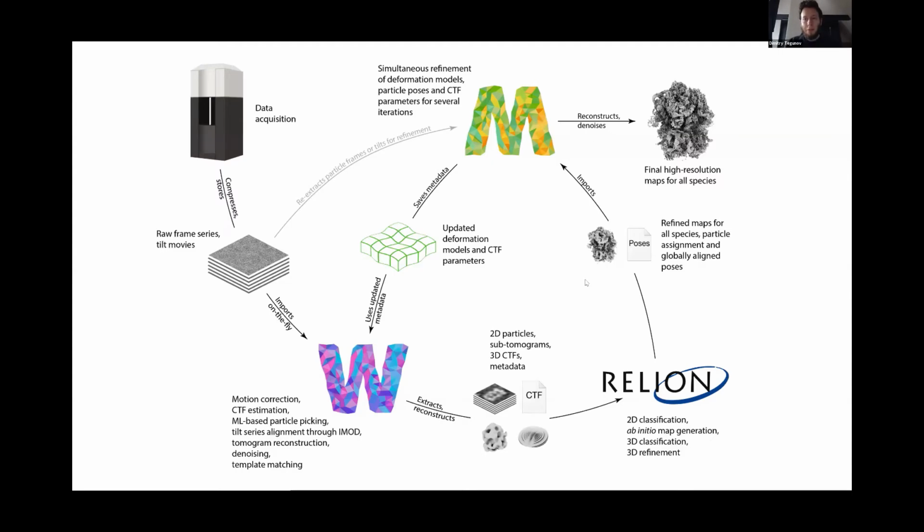Okay, so my introduction is going to be a bit shorter. I only have one slide. So I'm a big fan of this pipeline, mostly because I wrote 2/3 of it, and as you all know, you never go beyond 2/3. So the part that is most relevant to you is probably the one between the microscope and the big W, which stands for Warp. So for conventional 2D movie data, it's fully automated in Warp.